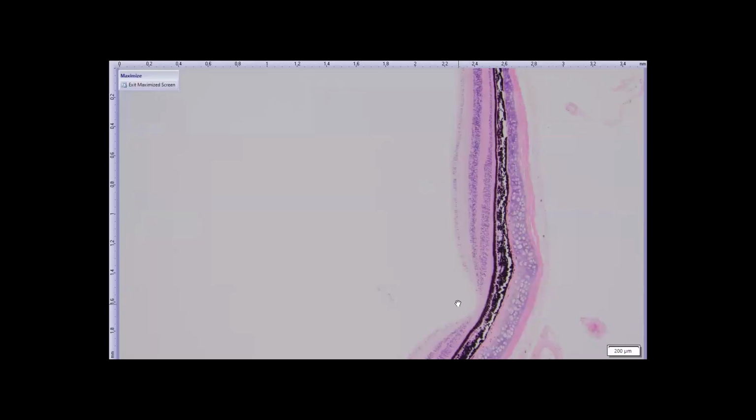Well, I mean, I guess the photosensitive part is there, just not the nuclei. Then they must have really long inner and outer segments or something. Yeah. Oh, okay. Weird.